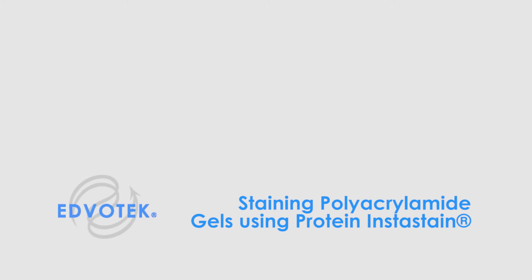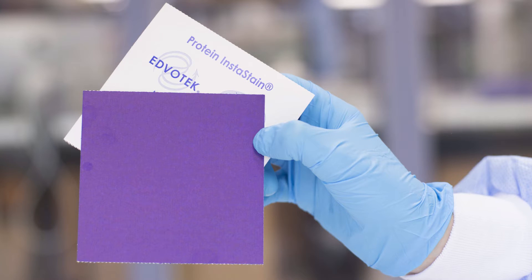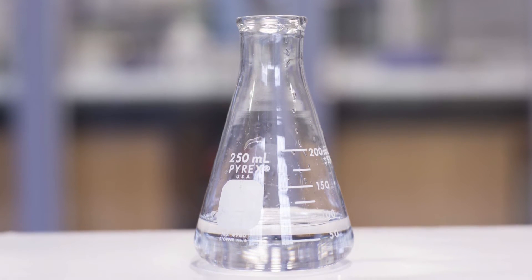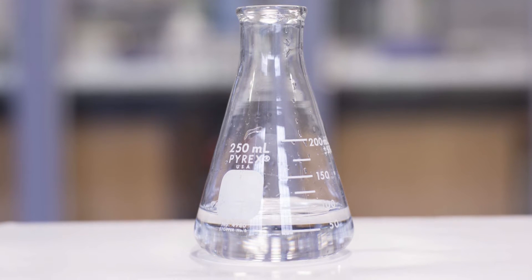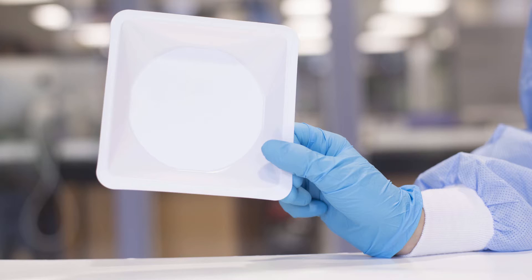Edvotech instructional videos. Staining polyacrylamide gels using protein instastain. For this experiment, you will need a polyacrylamide gel with proteins that have been electrophoresed, protein instastain, fixative solution composed of 10% glacial acetic acid and 50% methanol, an orbital shaker, and a small tray.